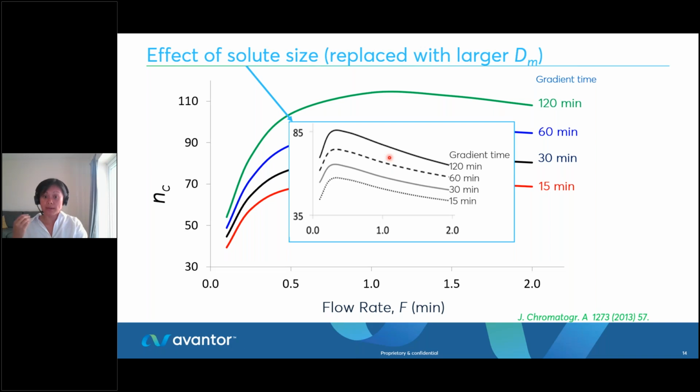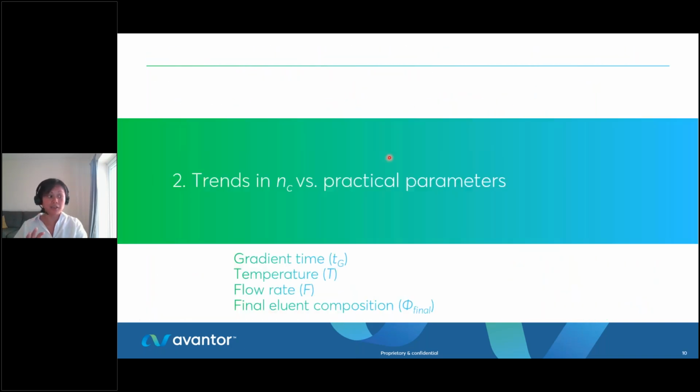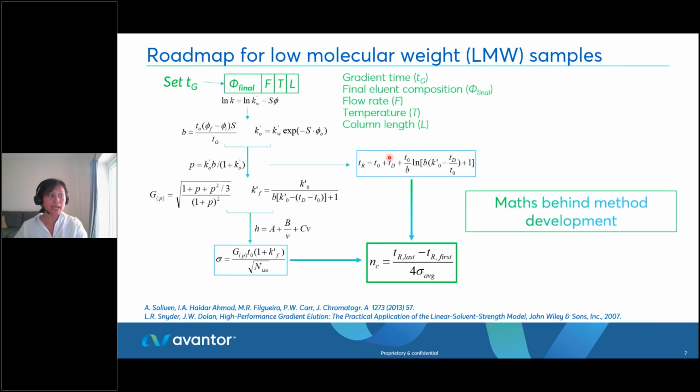They are just looking at a set of closed experiments for fixed isocratic conditions, while here we're looking at gradient elution theory, where maybe here we have the Van Deemter optima, but we have many other equations that pull the peak capacity in different directions.